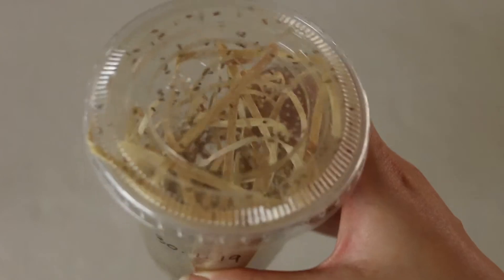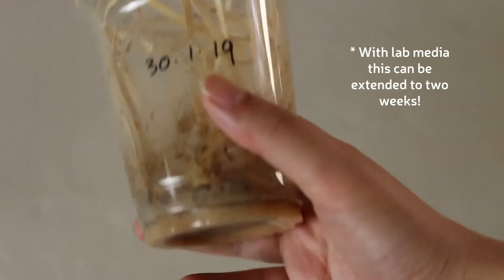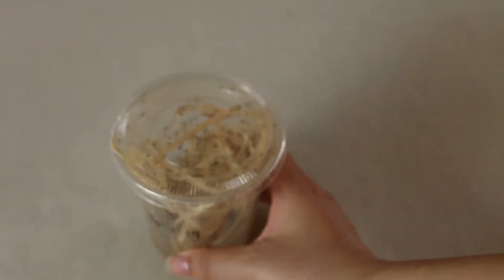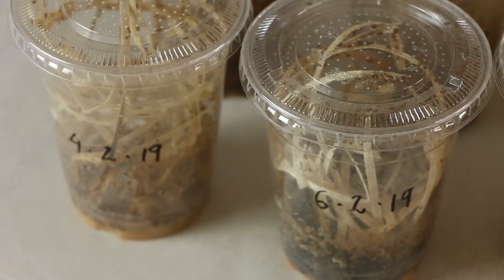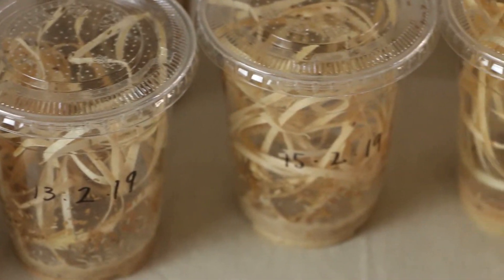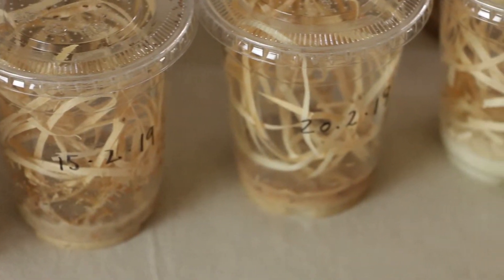This colony will continue to produce flies for about a week longer until it dies out. Keep in mind that, like most invertebrates, the lifespan and life cycle is shorter and faster if the temperature is warmer, and slower and longer if the temperature is cooler.